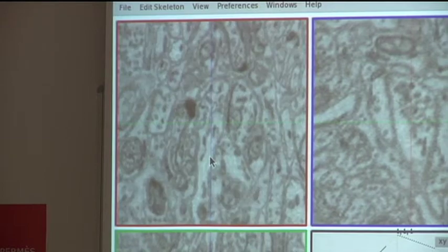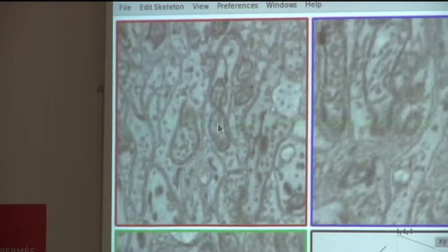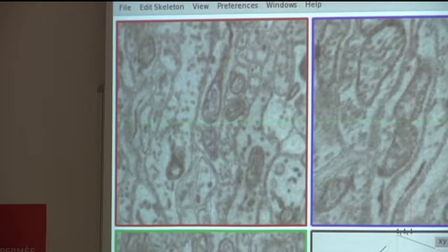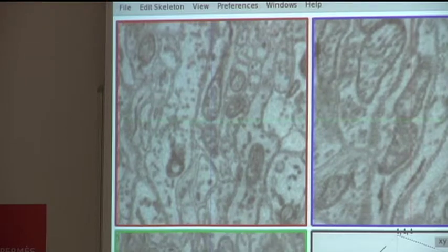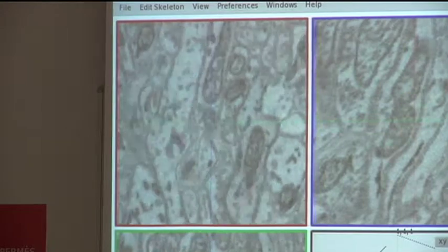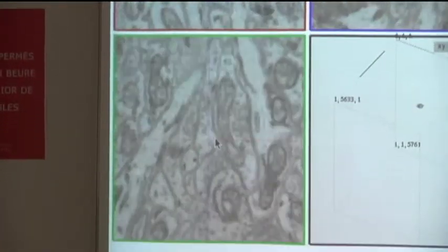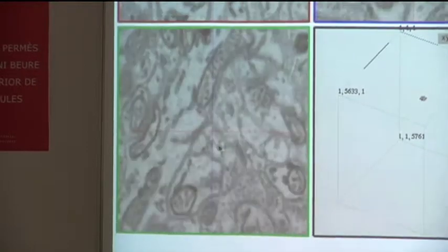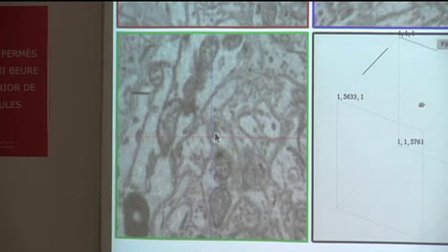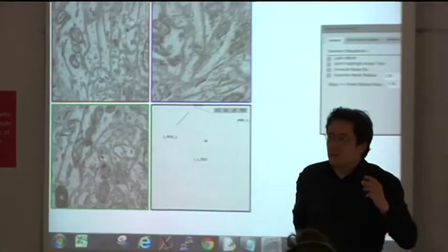Okay. I'm going to choose another one just for comparison. So again, mitochondrium here, mitochondrium there, ugly, but it is within a neurite that in this reslice can be seen, and then you can walk through it like this, and try to follow it. Okay? Here, you see it? Okay. The reason I'm doing this is because I think by now you're all able to do it. Yeah? And we'll try this now.